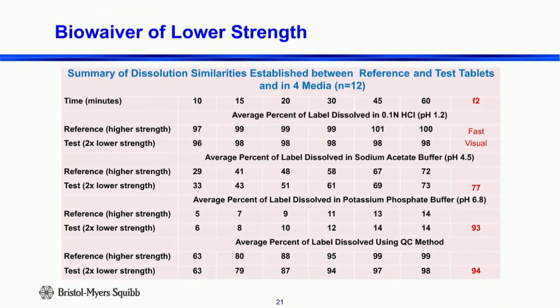So here's the data, right? This is a good example to demonstrate here because it is a basic drug. It has a pH-dependent solubility profile. So in this 4 pH comparison, we do have the fast dissolution profile, which is compared visually, and also has a gradual profile. You can see because of the pH dependency, it has very limited amount dissolved within the time frame of dissolution test.